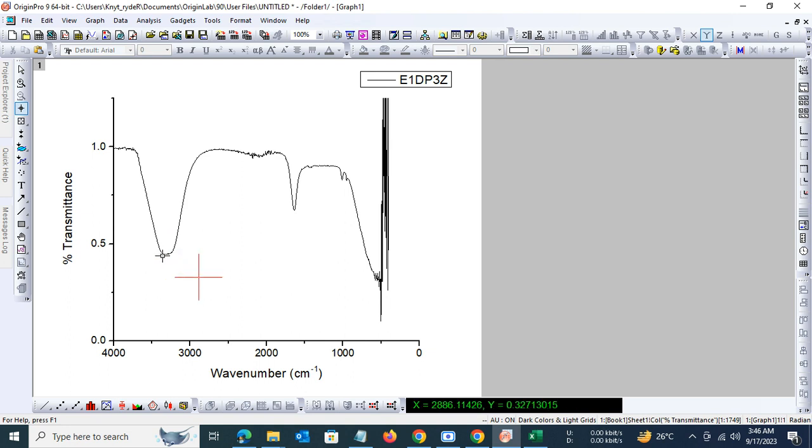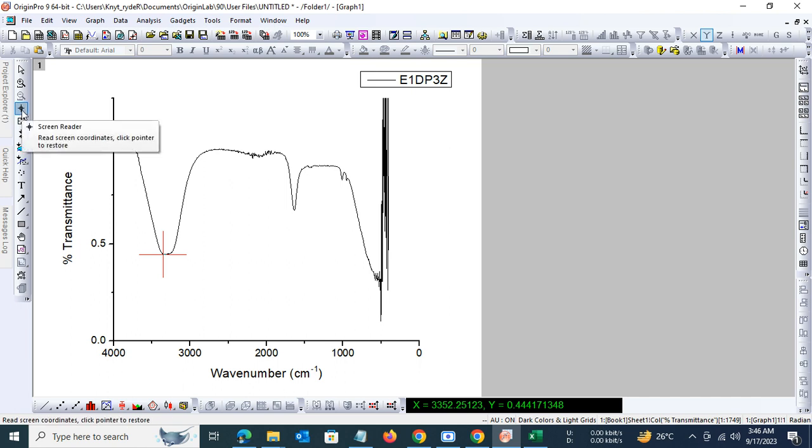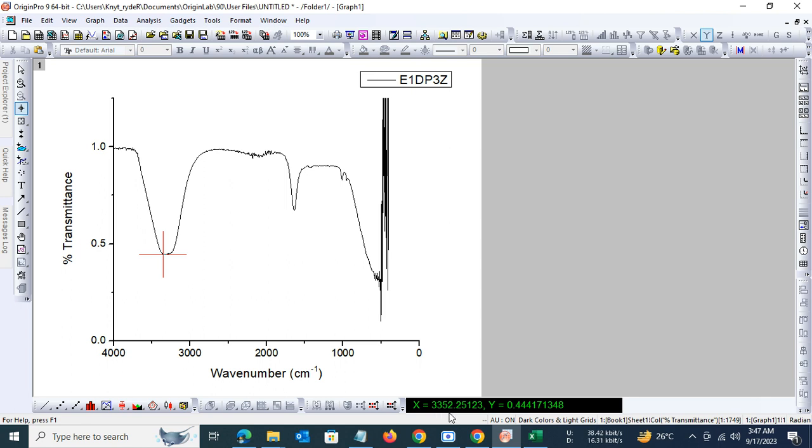You can see the peak point using this screen reader tool. It will give you the peak point. So that's 3352.25 and 0.44.